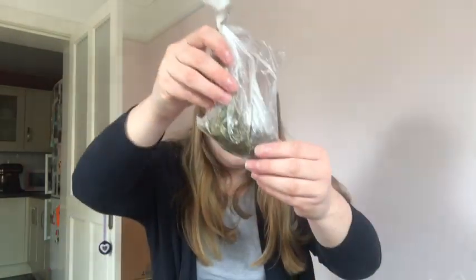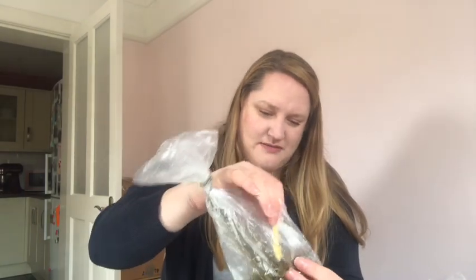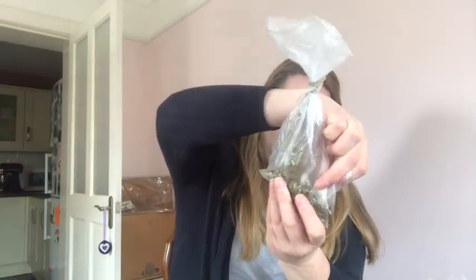So we're trying to get that wet, muddy bit from the bottom. Then, down near the roots, down near the mud, I'm just going to dip in the pH paper, giving it a bit of a squidge.